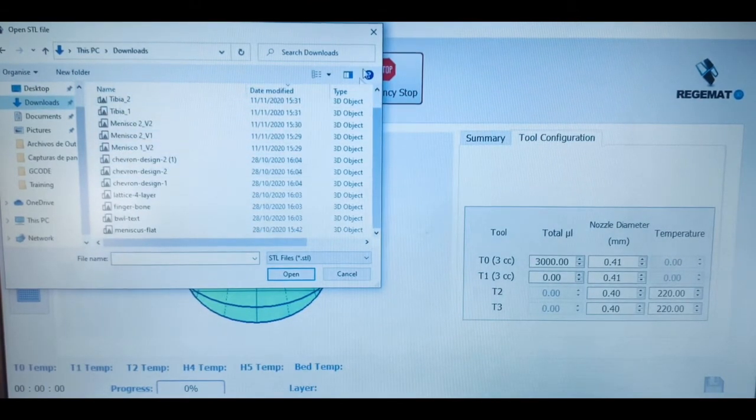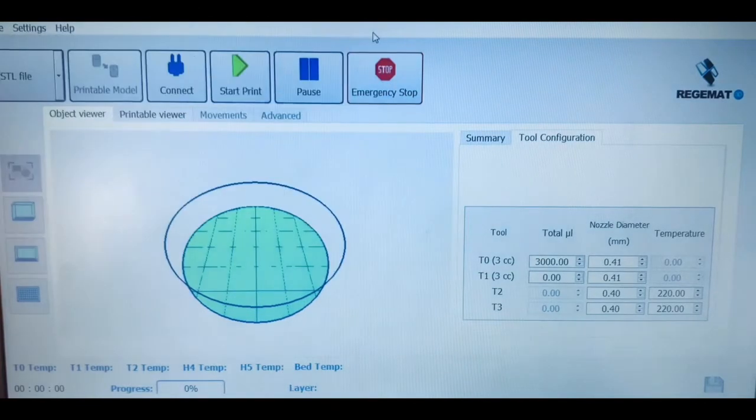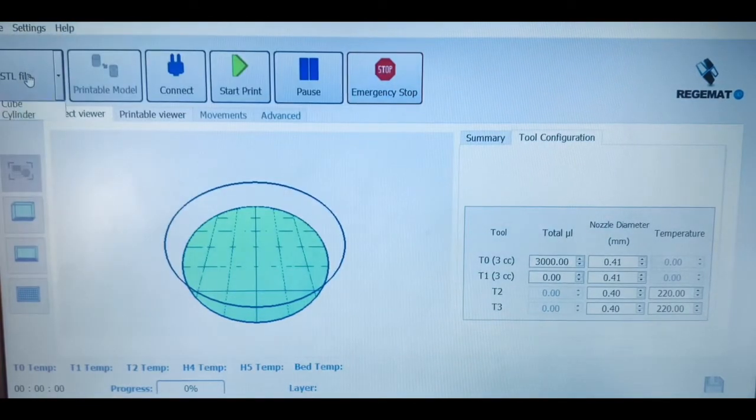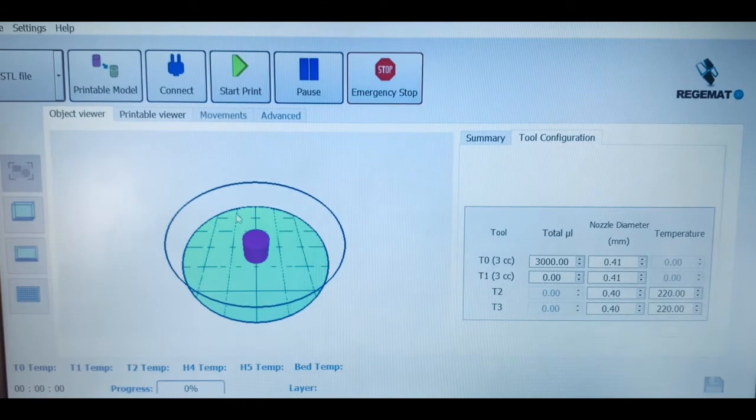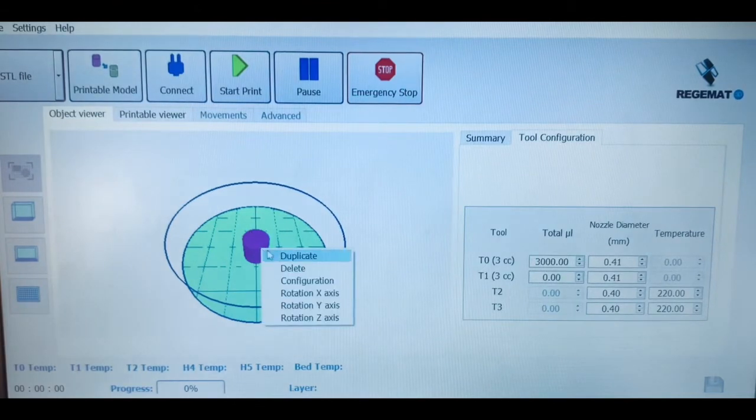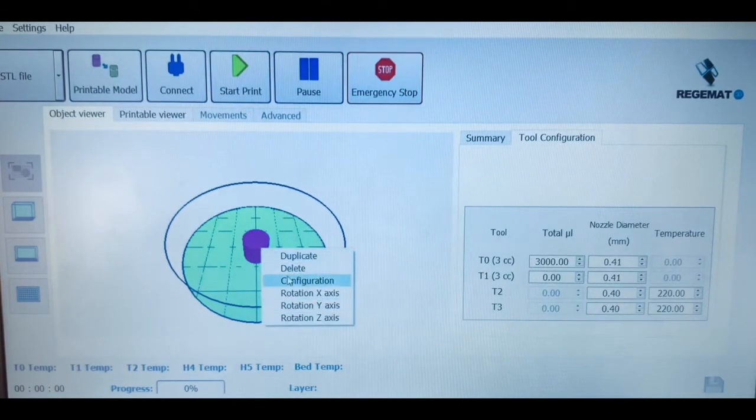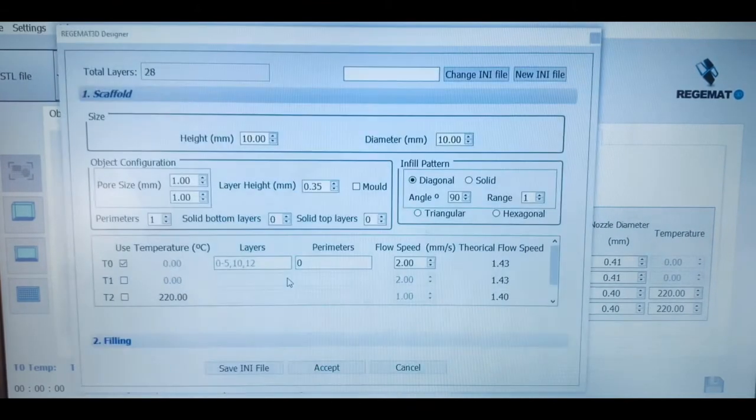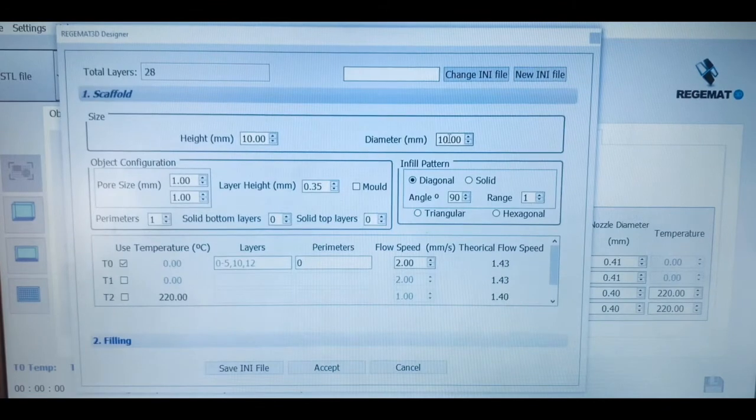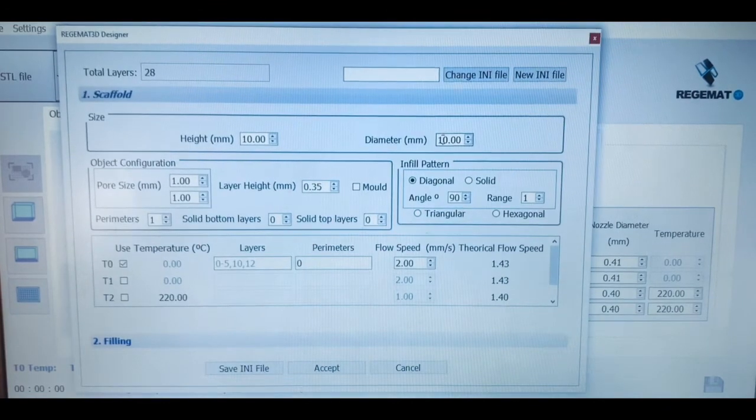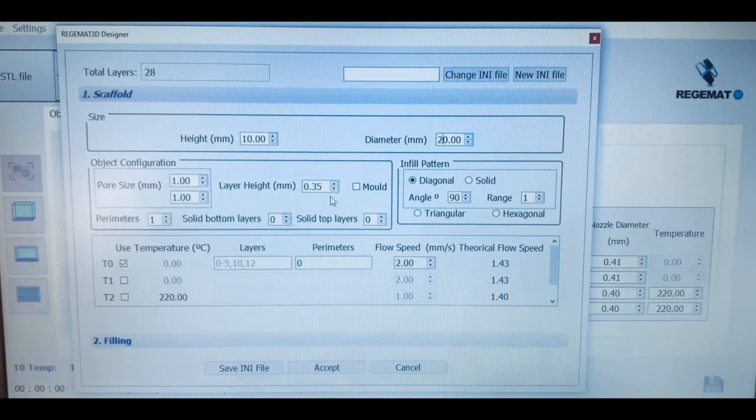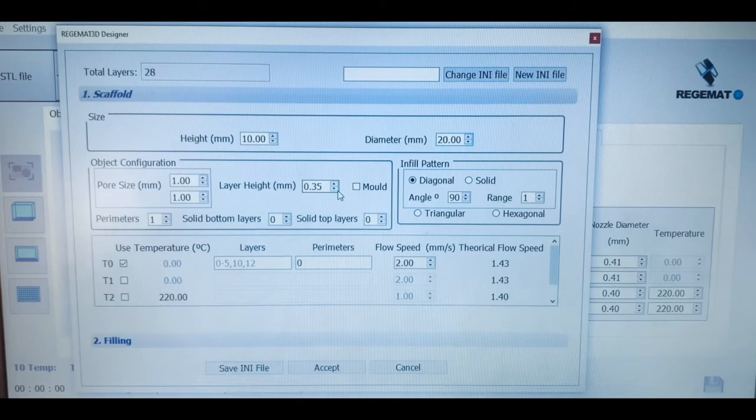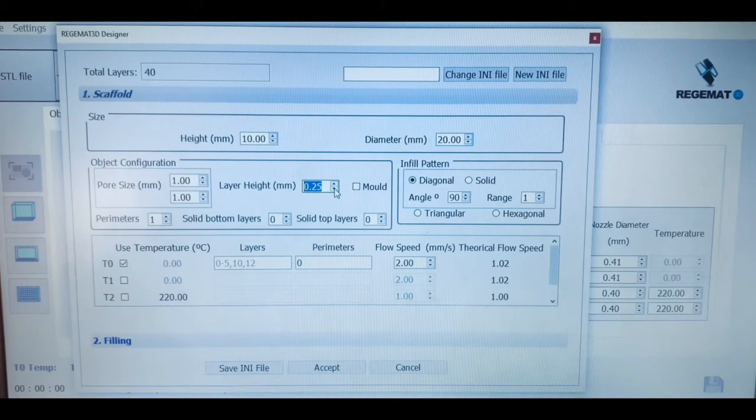Once we have selected the type of piece that we want to bioprint, we can fully configure it in terms of external settings and internal parameters. First, we can define the total number of layers by controlling the ratio between the total height of the piece and that for each of the layers.